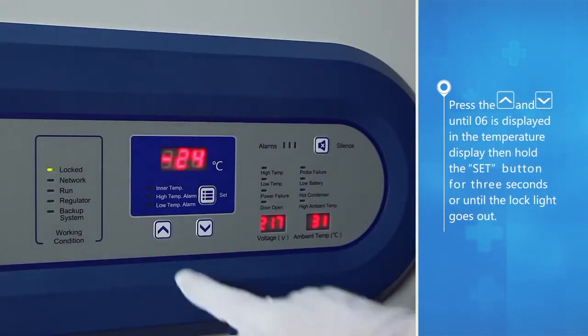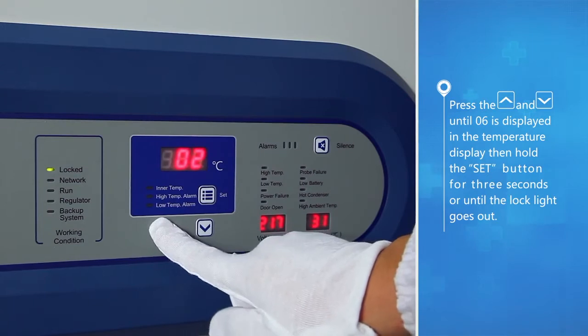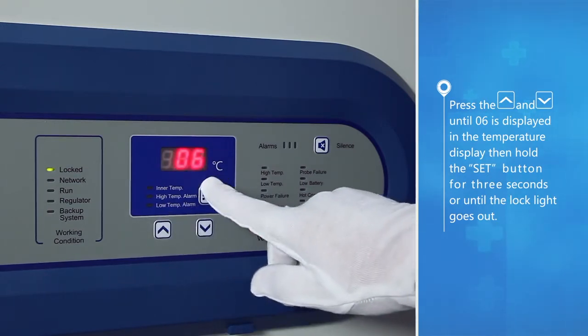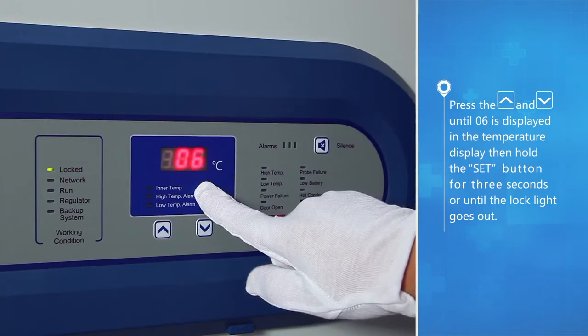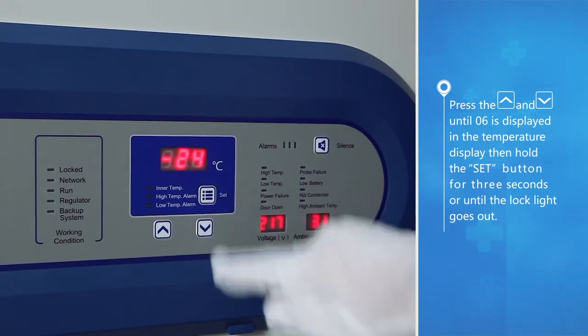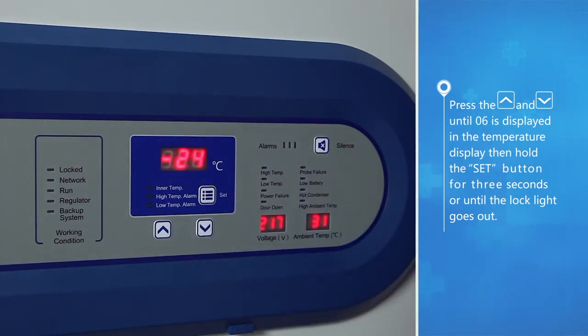Press the up button and down button until 06 is displayed in the temperature display then hold the set button for 3 seconds or until the lock light goes out.